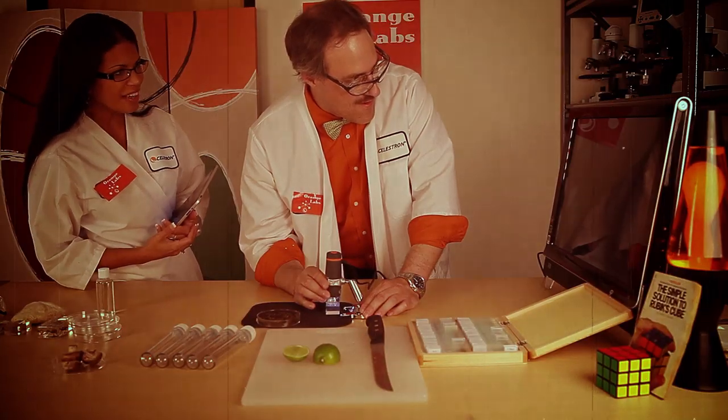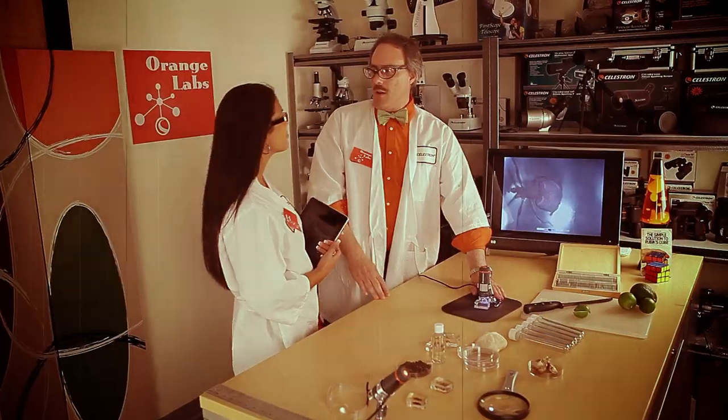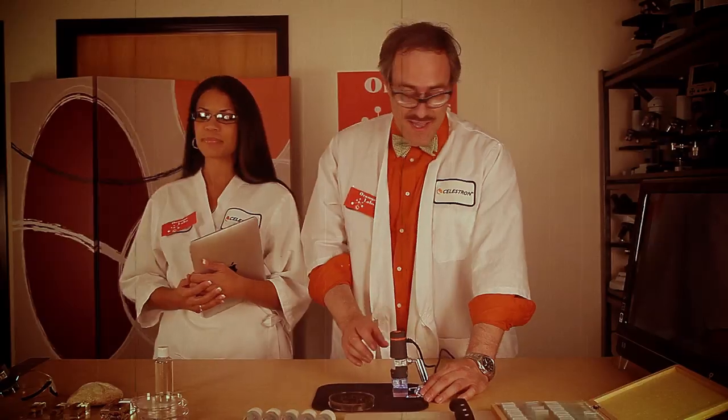What are you working on? Hello, Wyatt. I was just about to explore my latest discovery: the electronic digital microscope from Celestron. It allows you to see all kinds of things, like this ant here. It's fabulous. It's stupendous.